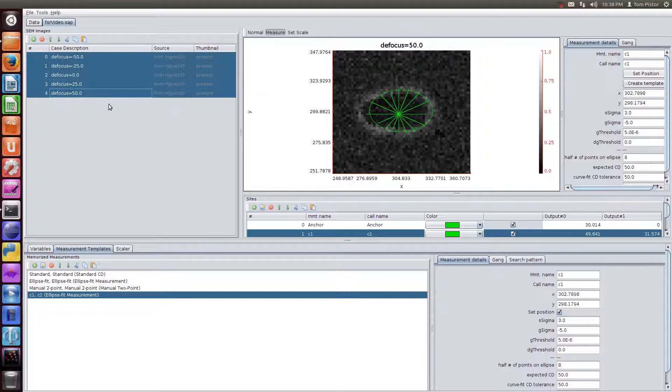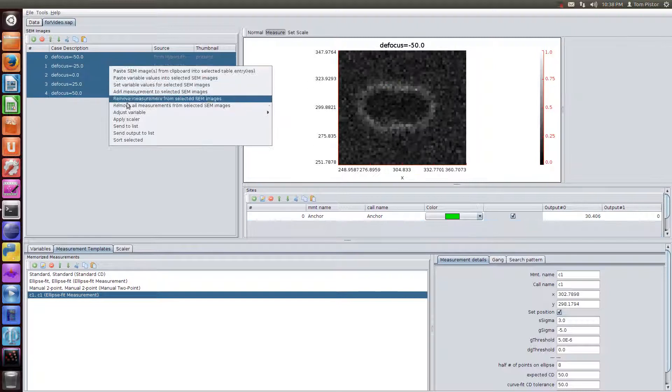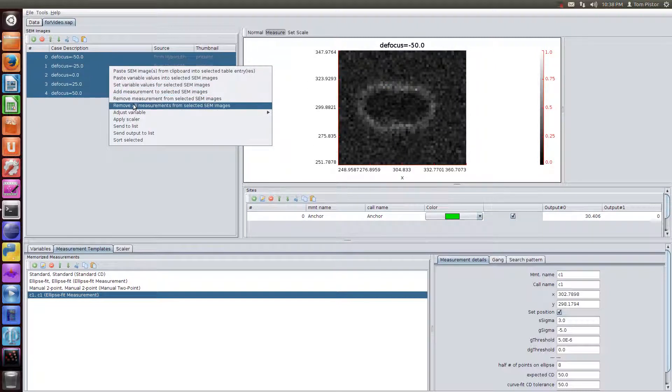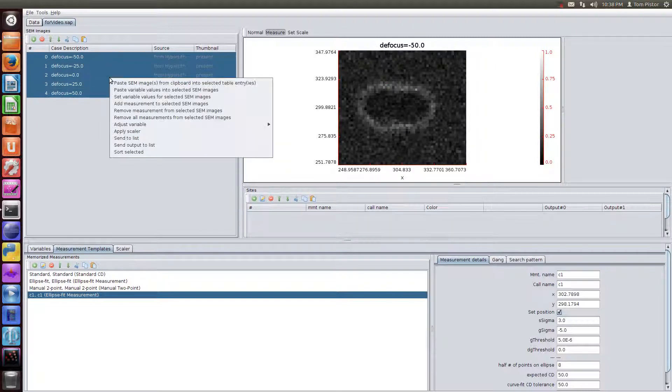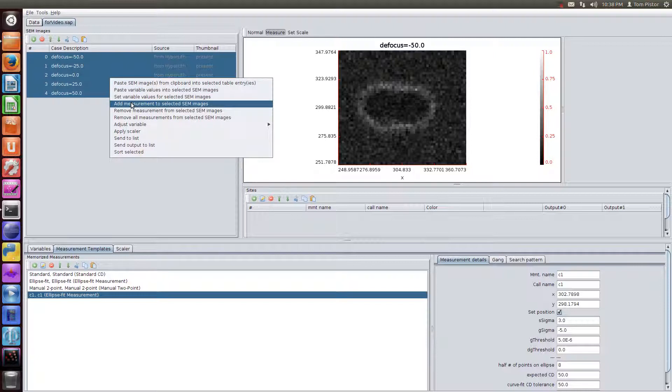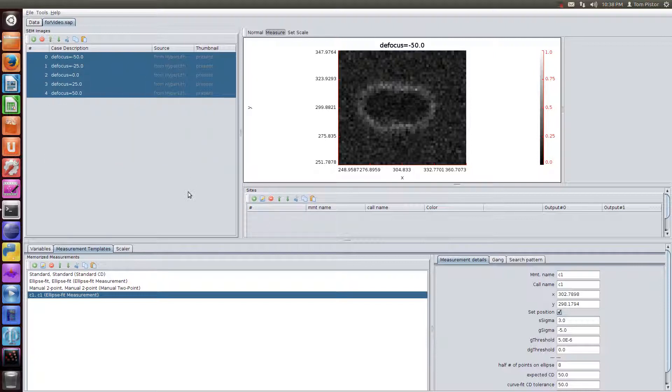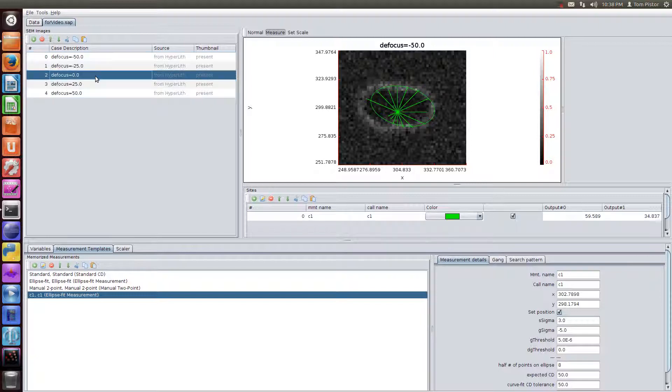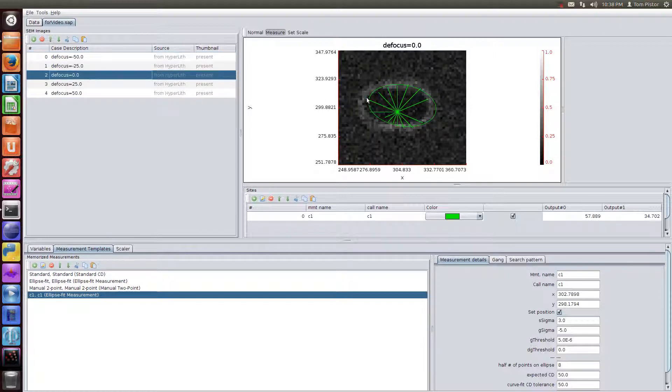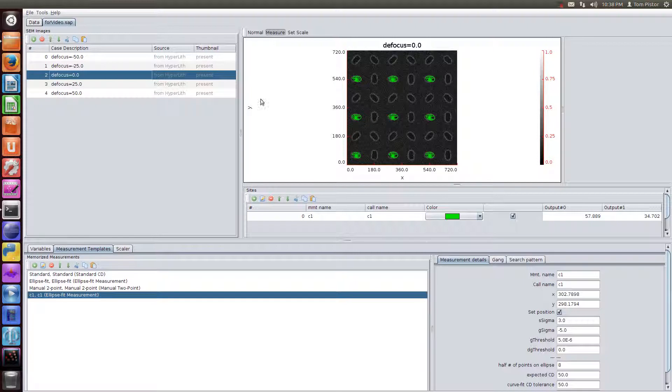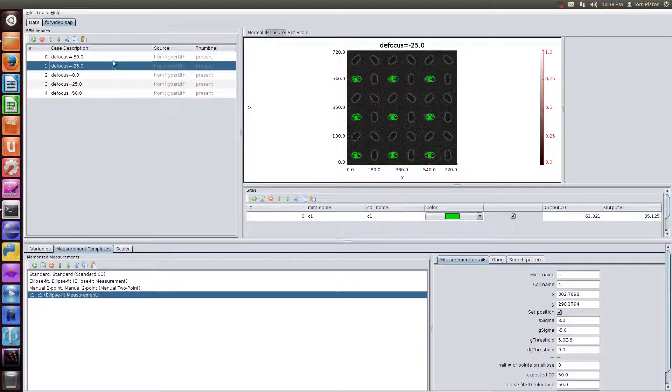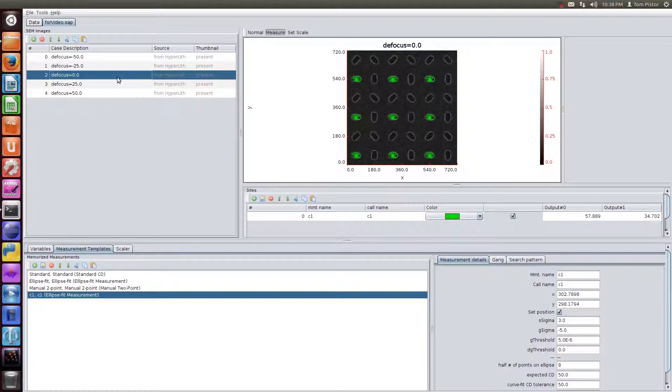So we'll select all of these. We'll remove all measurements from them and we'll add the C1 measurement. So it takes a few seconds to do the processing because it has to pattern match and then do all those measurements. Just think, each one of those contacts has 16 measurements, and then you have nine, and then you have five images. So now you've got them placed on all of the images.